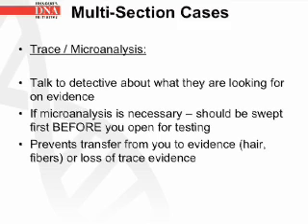For trace or microanalysis, talk to the detective to find out what they are looking for on the evidence. If microanalysis is necessary, the evidence should be swept first before you open for testing. This prevents the transfer from you to the evidence, like hairs or fibers, or the loss of trace evidence.